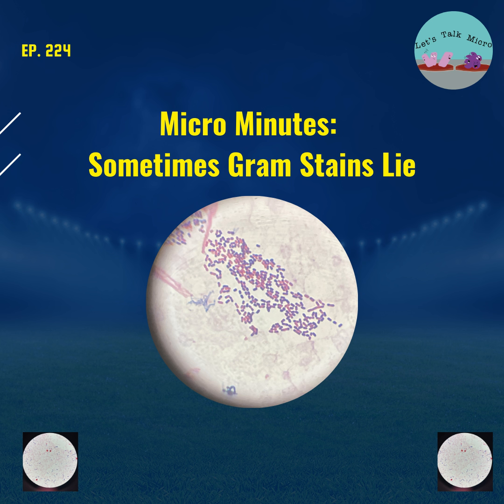So let's say Neisseria gonorrhea, which is a gram-negative diplococci, they are larger than your coccobacilli. And you can clearly see that kidney bean or coffee bean shape. And then the other is, scan the slide. When you have that scenario where you cannot tell if you have a cocci or a rod, keep looking. And if you're looking around and maybe in some fields you see some tiny rod shaped organisms, then you have a gram negative rod and not a cocci.